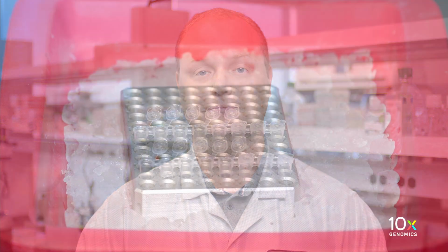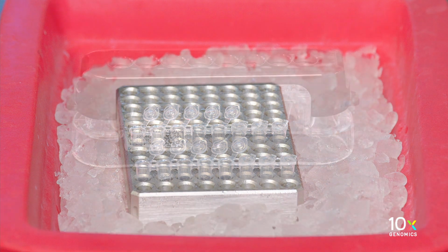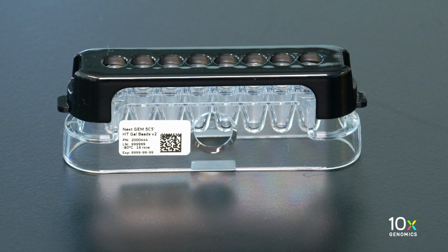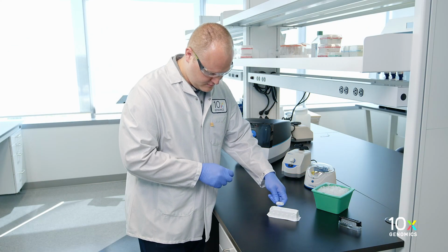We just combined the master mix, water, and single-cell suspension. Now we will immediately load the chip. We have the combined master mix and single-cell suspension on ice. The NextGem single-cell 5'HT V2 gel beads have been equilibrated to room temperature for at least 30 minutes. And we have partitioning oil. We are ready to load the chip.